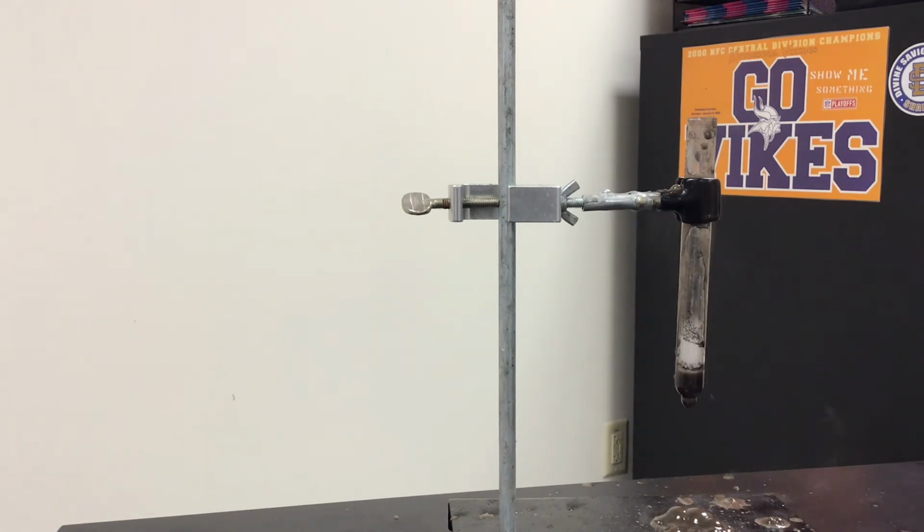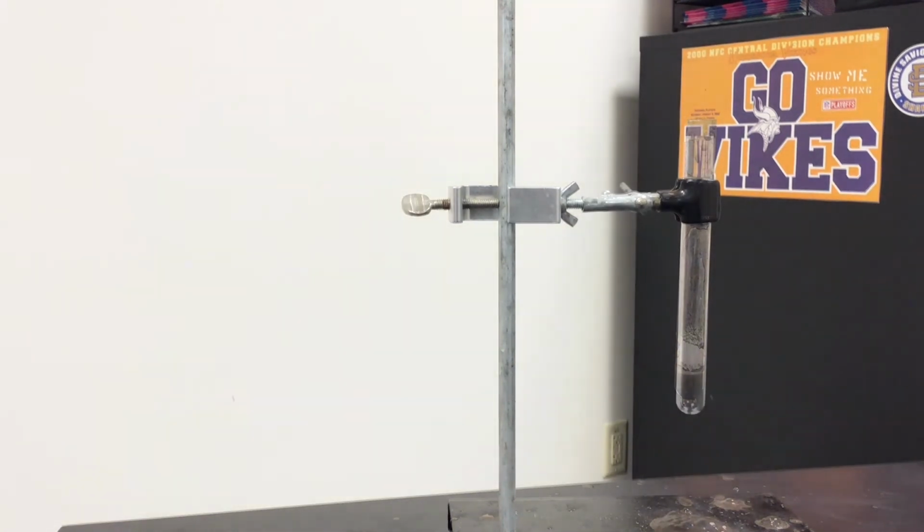I guess this is a test run. We'll do it again. Trial number 2.